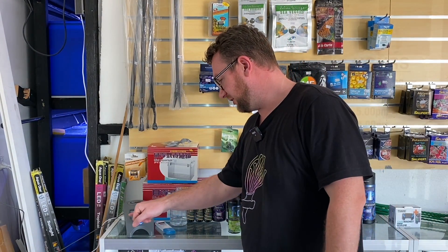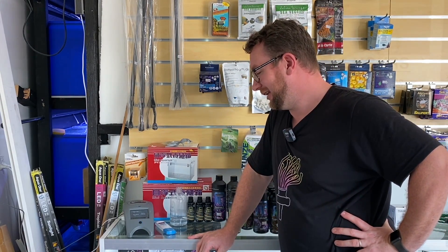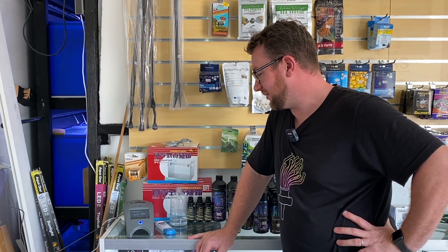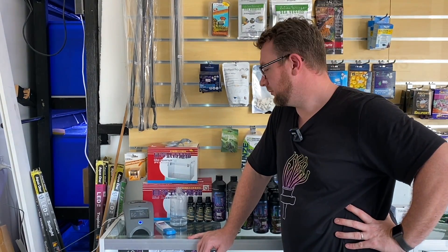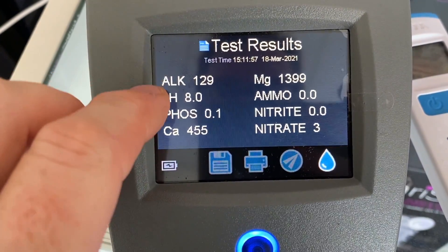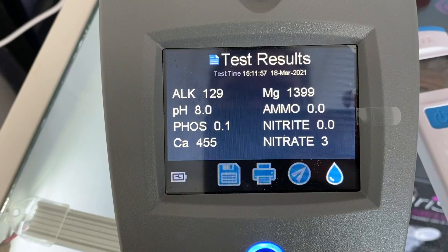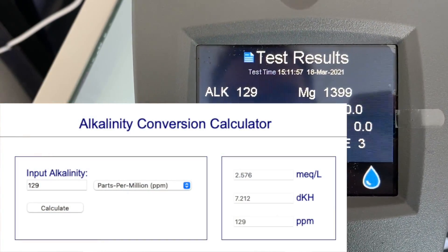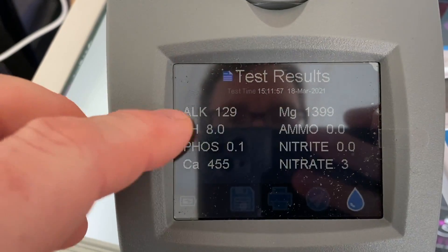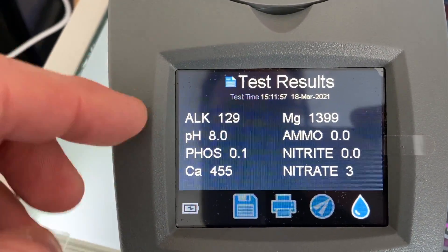We get a little status bar as it goes through the test — we're about four-fifths of the way through. Once the results come in, alkalinity is displayed in ppm. 129 ppm converts to about 7.2 dKH which is fine. I tested this at about 7.3 to 7.4 at home, but we're reading about the same result, so that's a happy outcome.